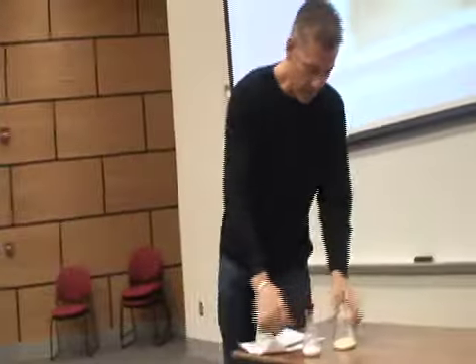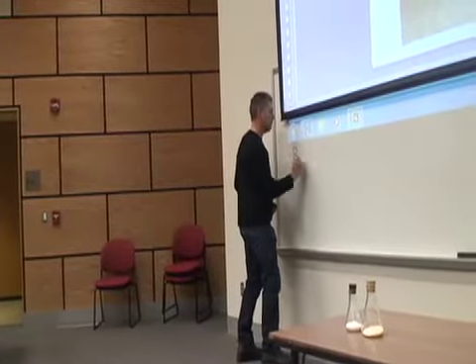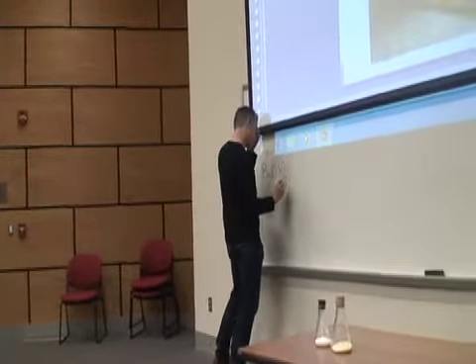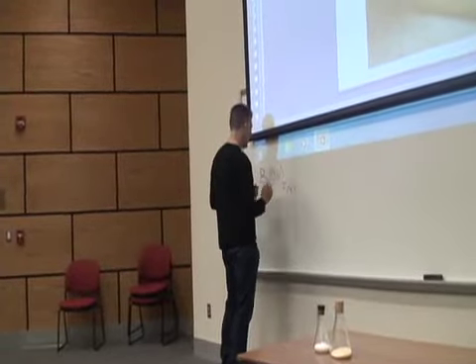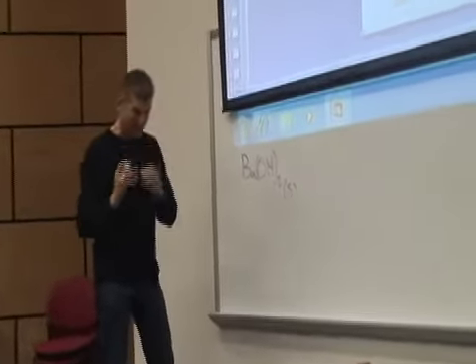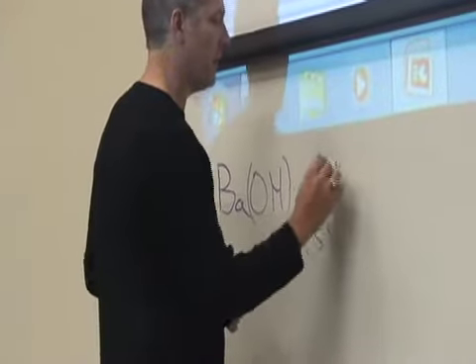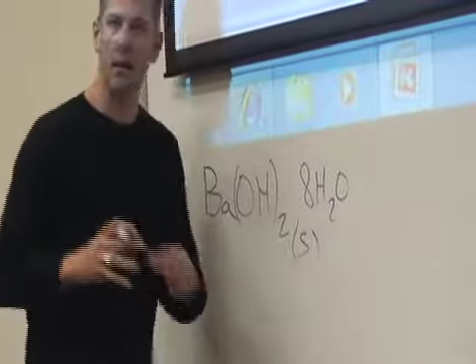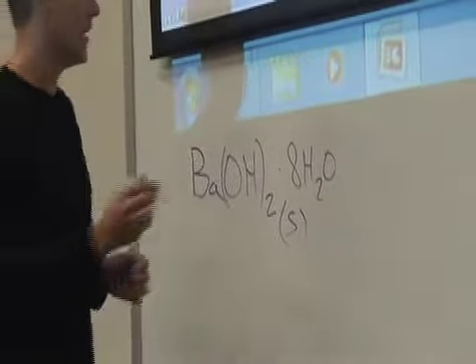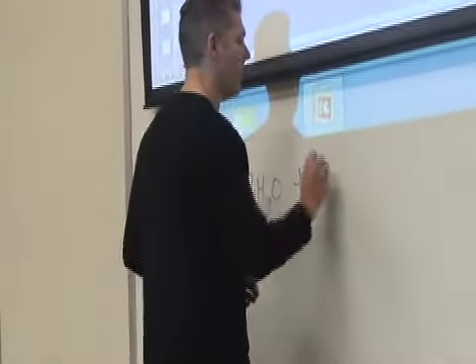This is going to be a full write-up. We have barium hydroxide — that's the more white solid there. It's a white solid, but associated with this barium hydroxide in that white crystalline powder, there are actually what are called eight waters of hydration. They're water molecules that are in the crystal lattice, but they're obviously not in the liquid state — they're crystallized within this barium hydroxide lattice. We're adding to this ammonium thiocyanate.